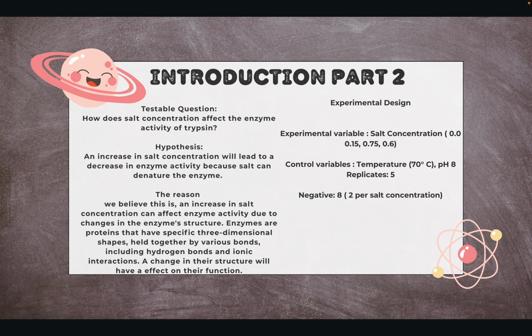Furthermore, our reason: an increase in salt concentration can affect enzyme activity due to changes in enzyme structure because of the denaturing. Like proteins, an enzyme's structure determines its function, so a change in structure will ultimately change or differ its function. Our experimental design.